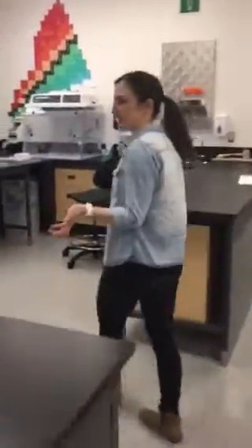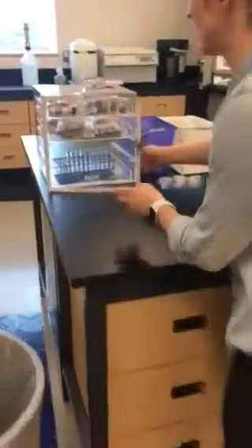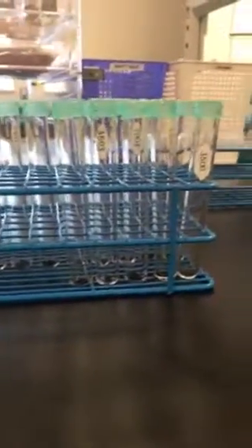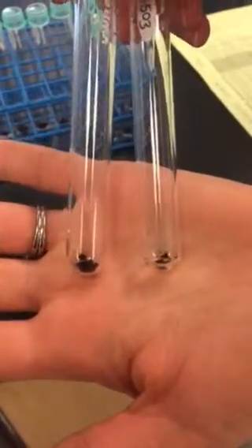This is the first stage of pre-treatment. So we receive the samples of wood, charcoal, bone, shell, and we arrange them according to sample type. So we get all organized on these sheets here. This is a batch of charcoal, and just to show you, we need very little material. And that's because we use the accelerator mass spectrometer, or AMS. And these are samples of charcoal that we're going to process on Monday.